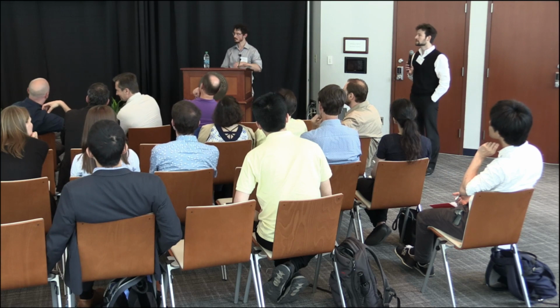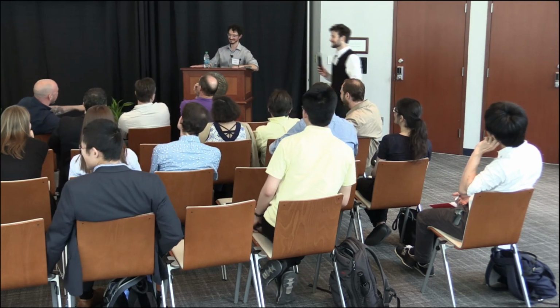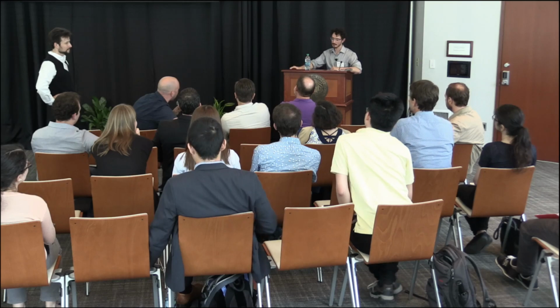Other questions? So I'll ask this: does your freeze-thaw efficiency change with the number of cells, and the cell type?